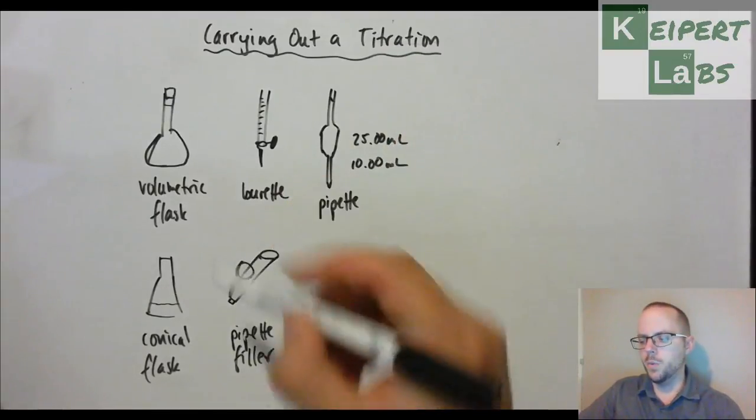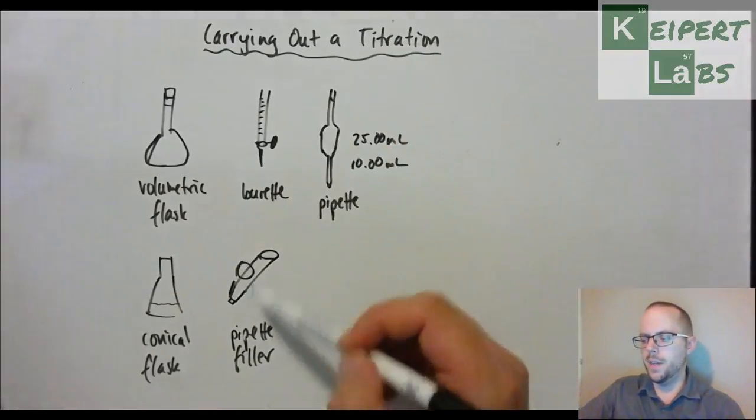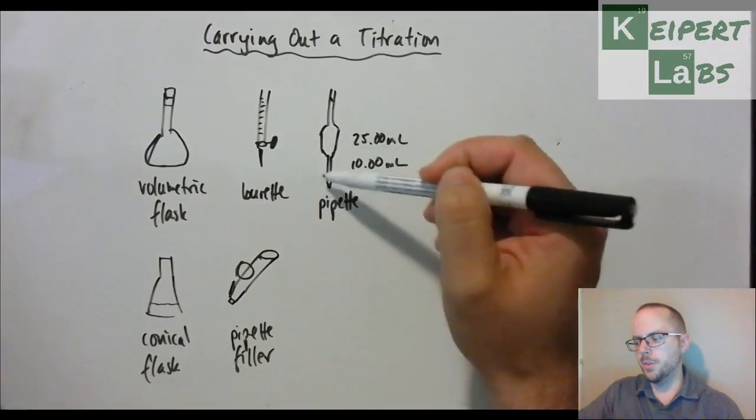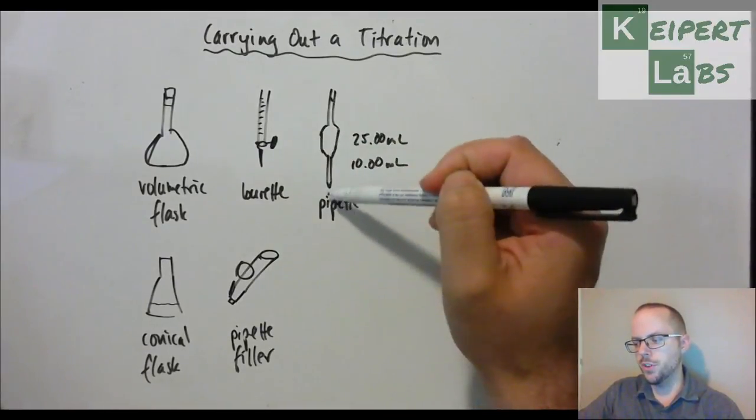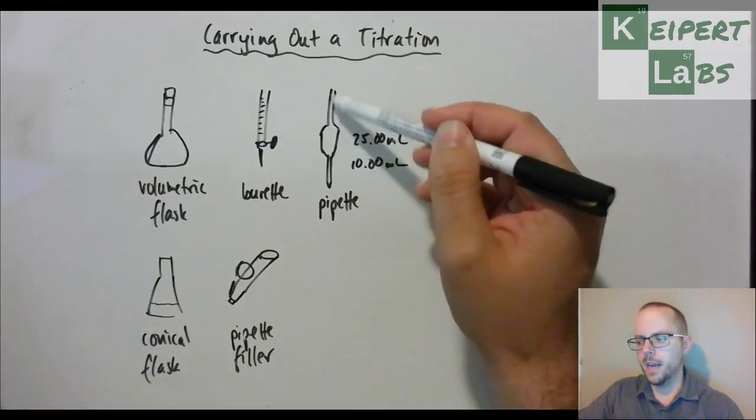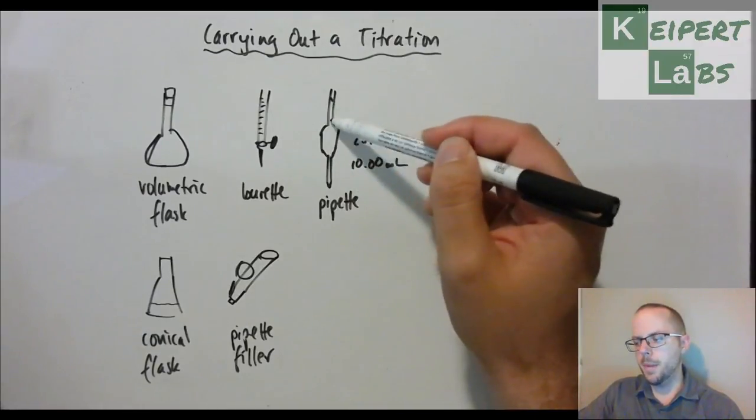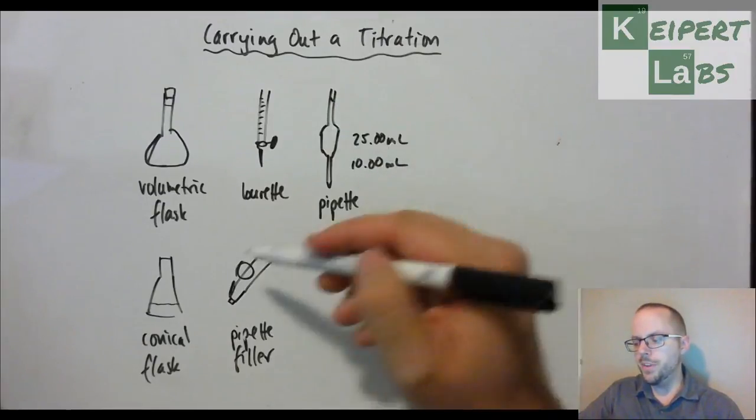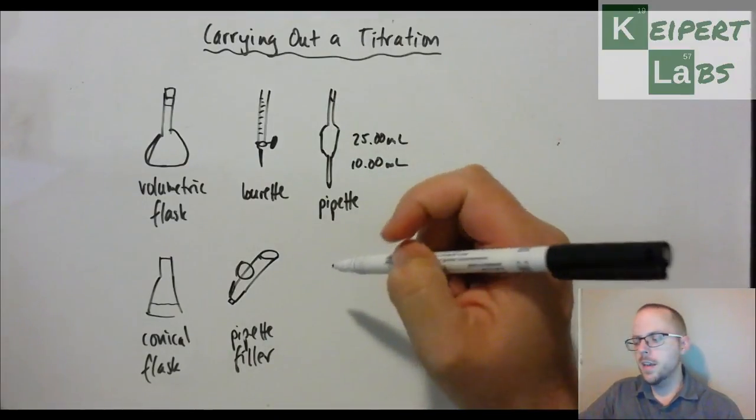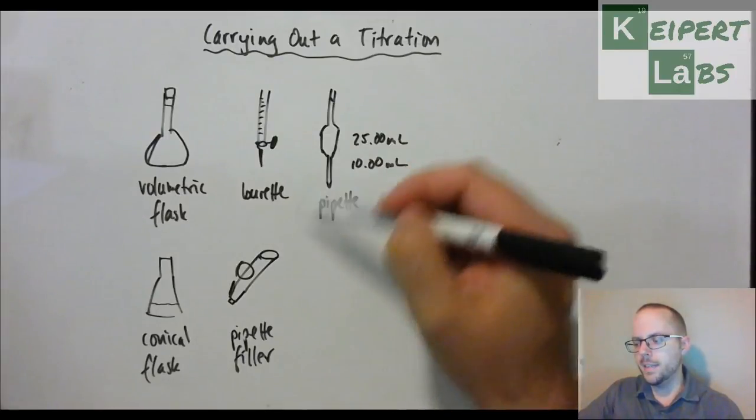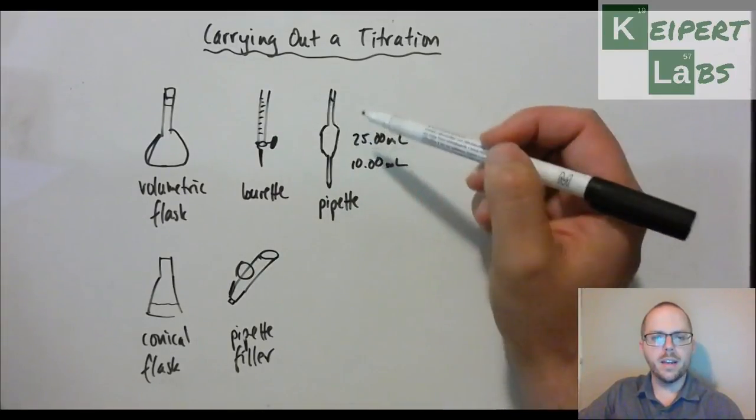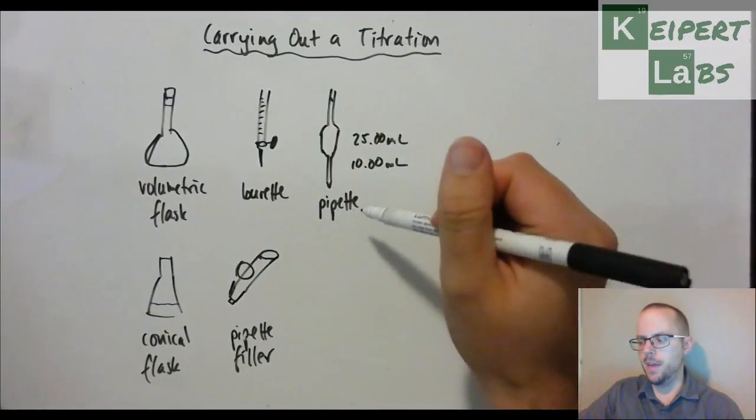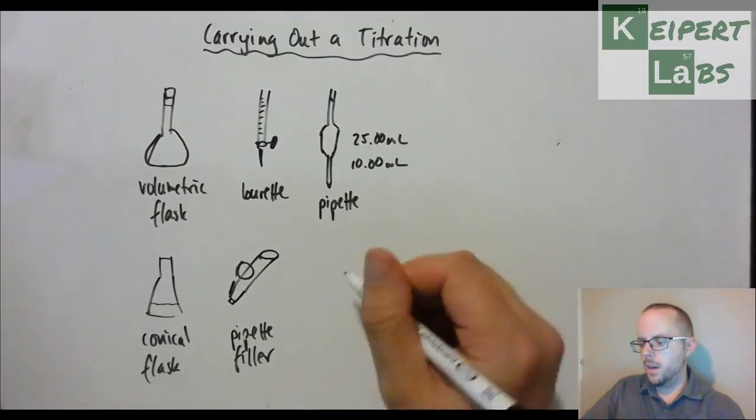You attach it to the top. These ones have a little wheel that you roll. What that does is reduce the pressure inside here, which means the atmospheric pressure on the outside is greater and pushes the solution up into that space, into that vacuum at the top. You get it above the line and then, with different pipette fillers there's different techniques, but you basically will release solution down to where the meniscus sits on that little line so that the pipette has that volume accurately in there.